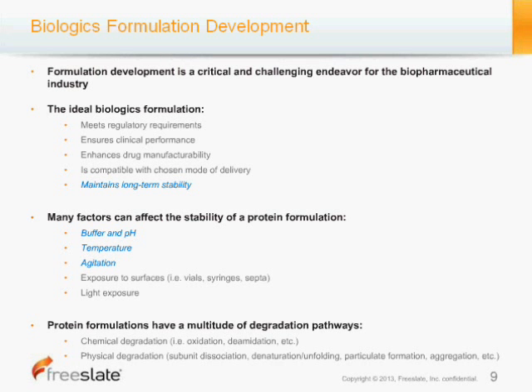And so specifically here I've italicized in blue maintains long-term stability. So that's another big part. It obviously plays into manufacturability. But in this case, this is one of the areas that this study is working around.